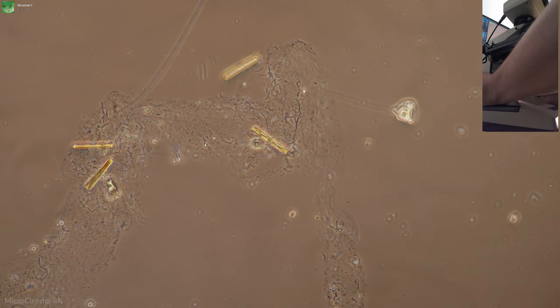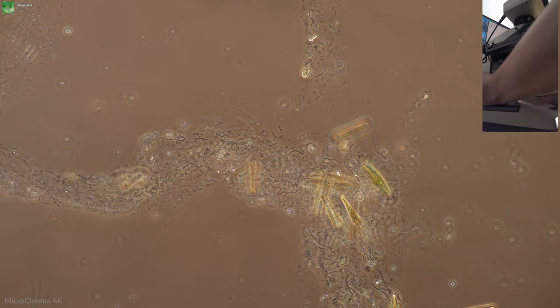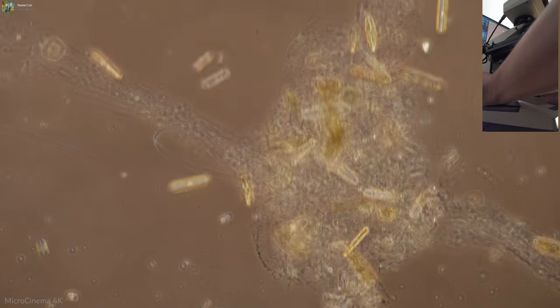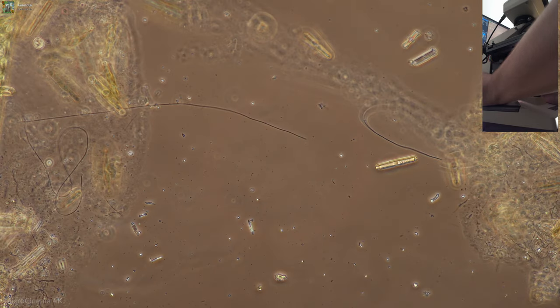Let's see if we can find... yeah, we can see some little fibrous bacteria. Oh, there's a nice one there. You can see they're nice and dark.